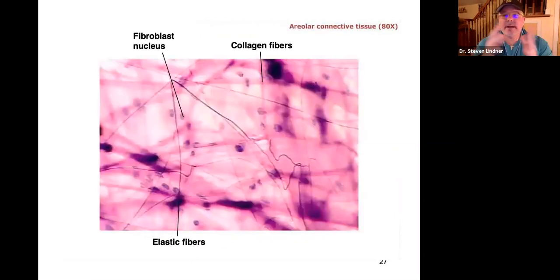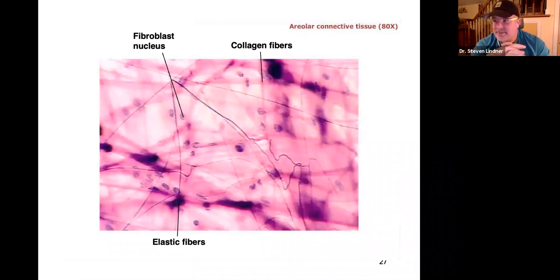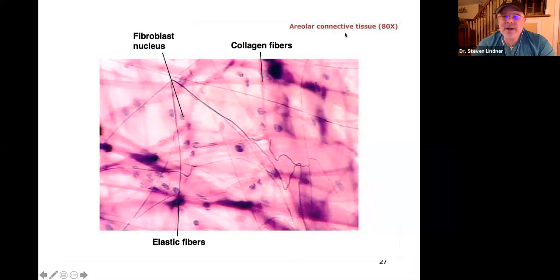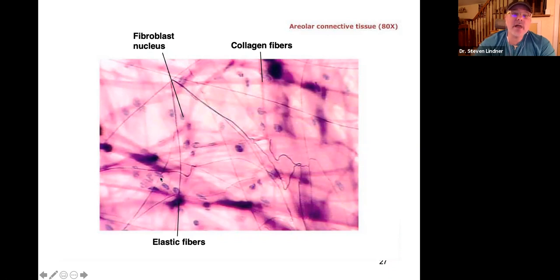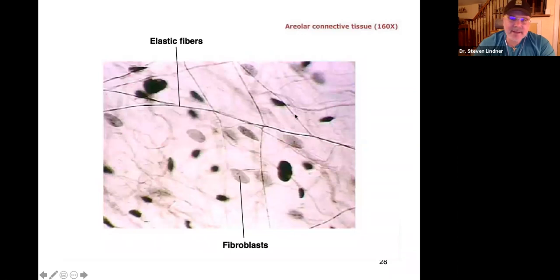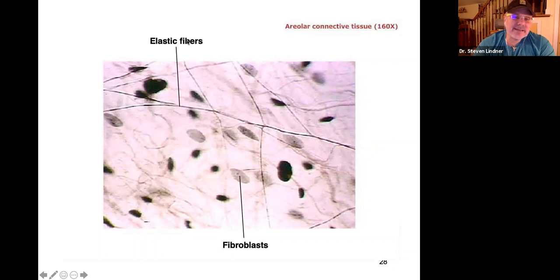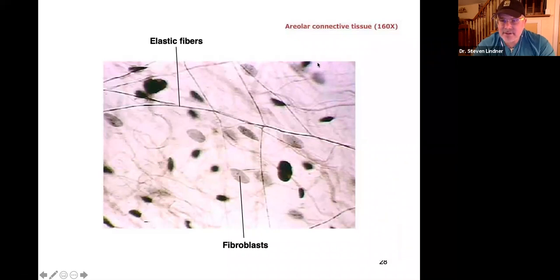Now looking at connective tissue types. This is areolar connective tissue — what separates your skin from your muscles. It looks like scattered fibers with cells here and there, lots of matrix and protein fibers. That classical mesh-like appearance is areolar connective tissue. You won't need to identify specific fibers like elastic fibers or fibroblasts — just identify the type: areolar.